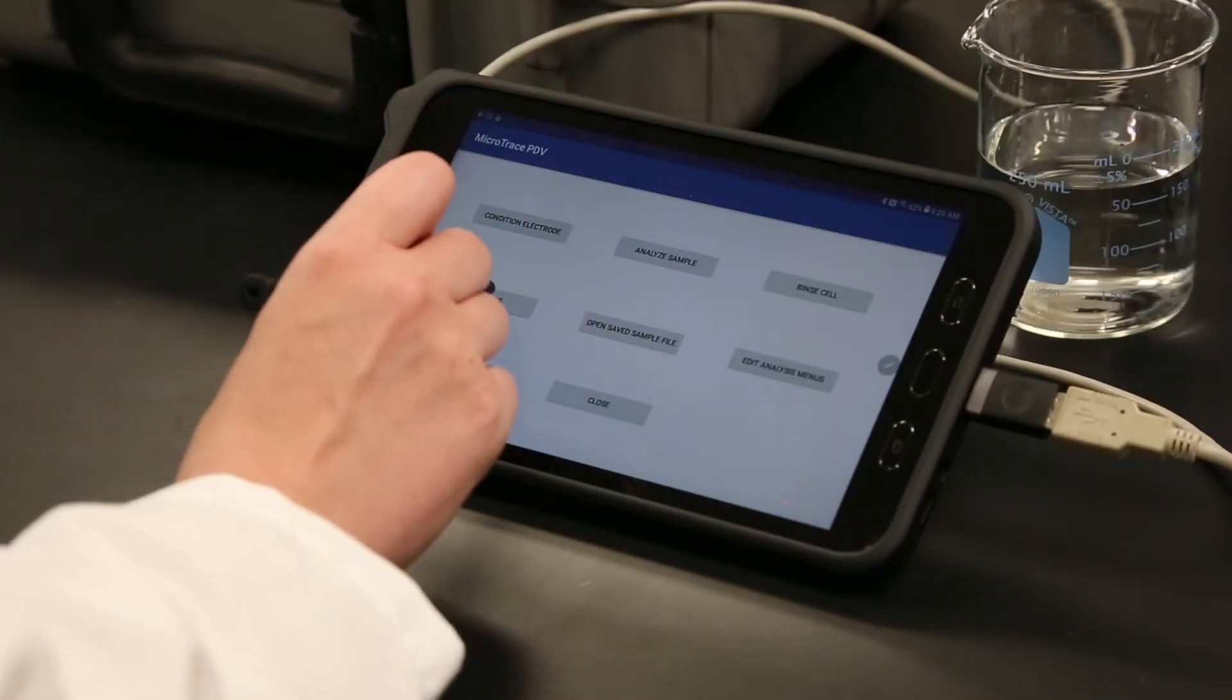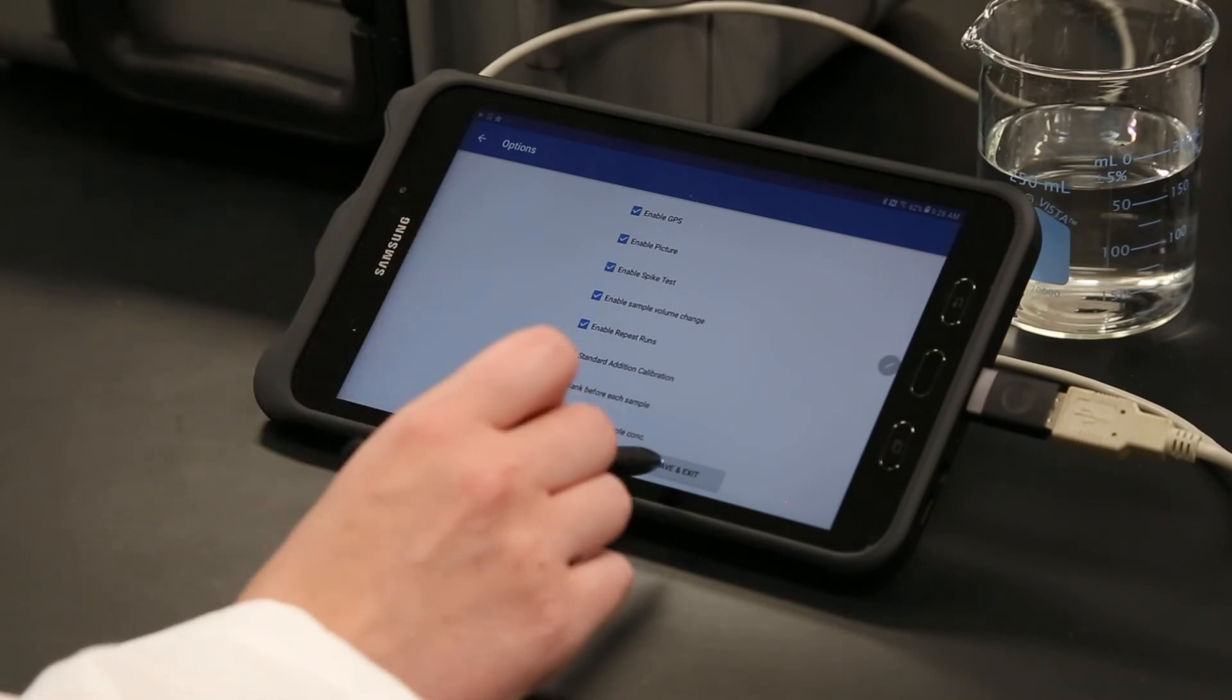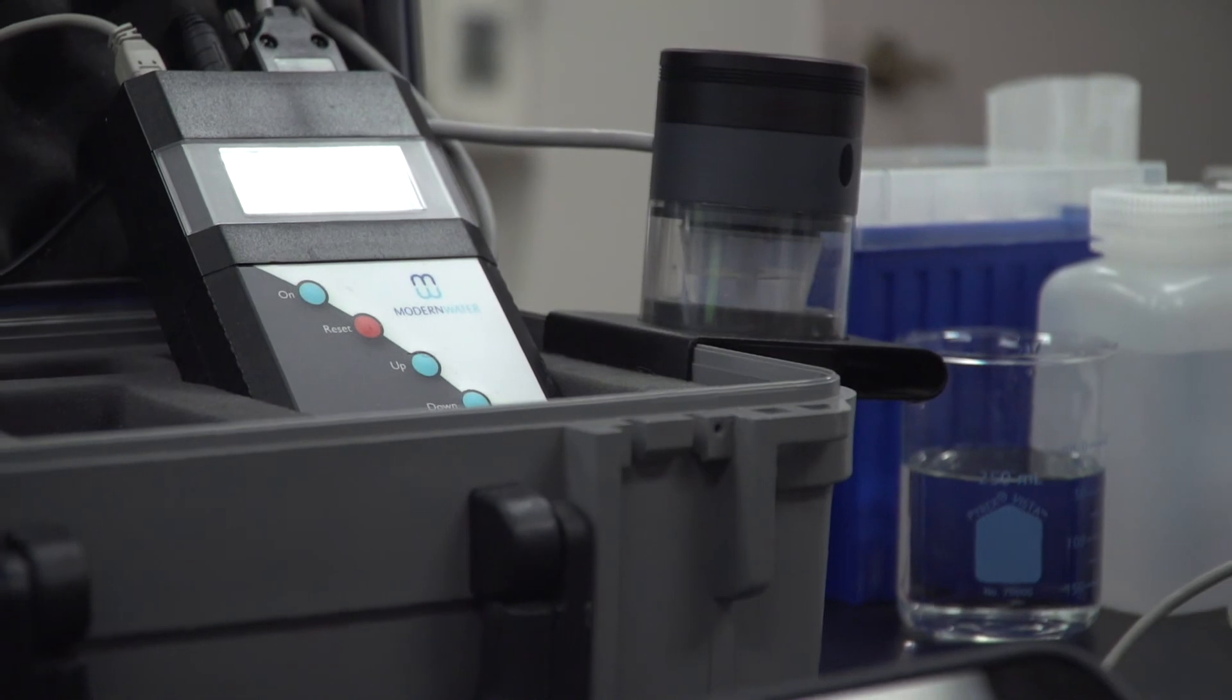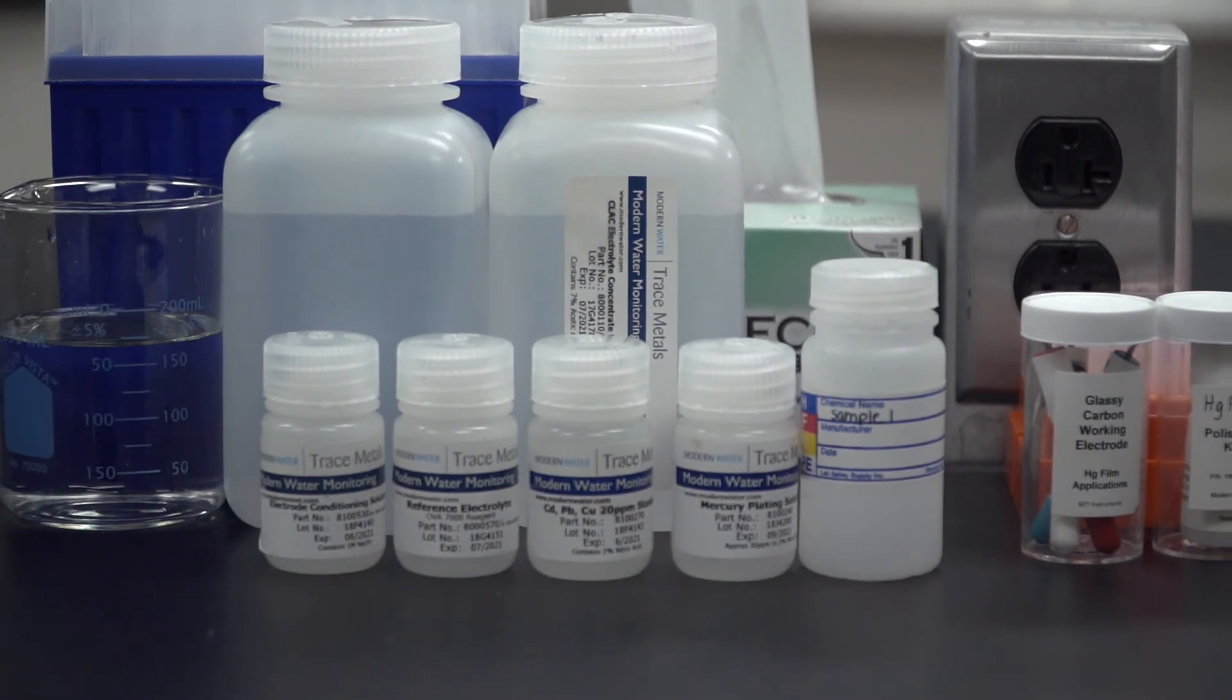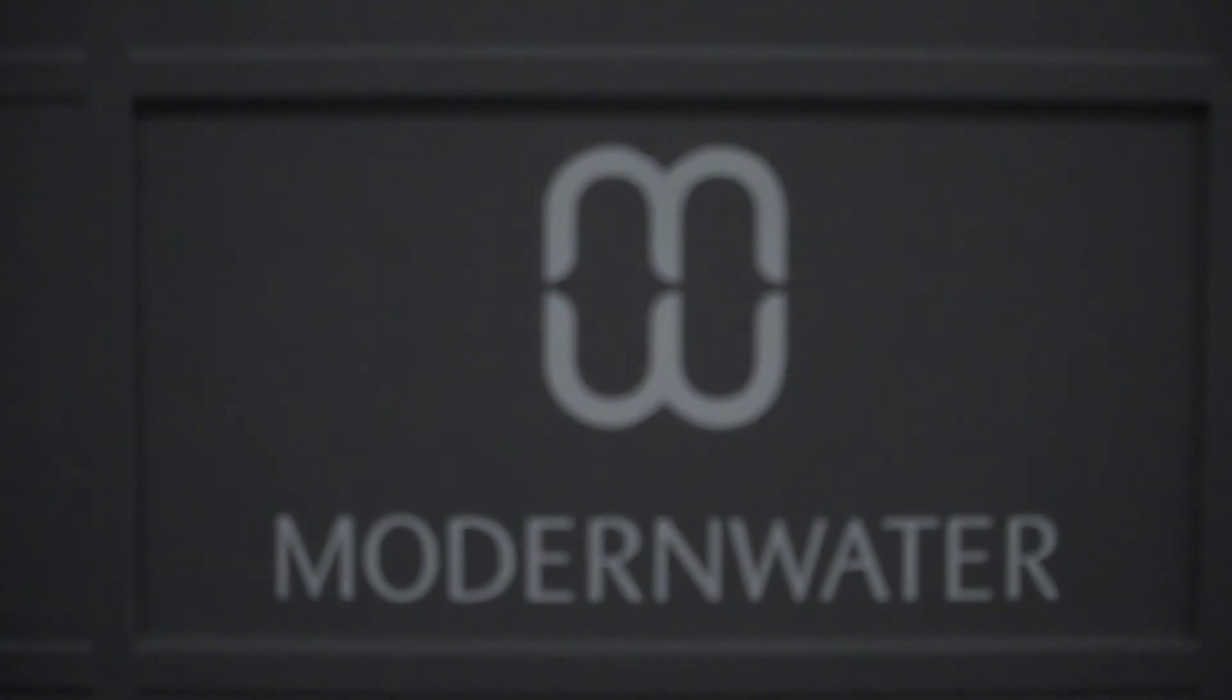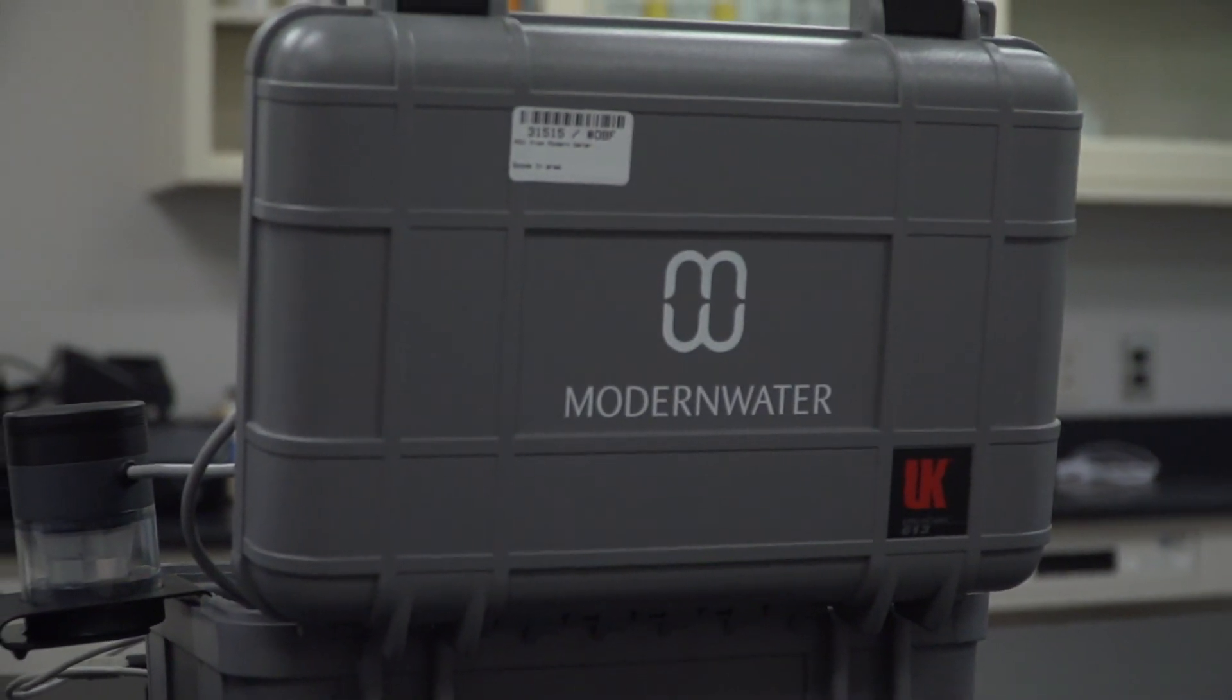Other analysis options such as sample spike testing, standard addition calibration, and other features are explained in the manual. The Microtrace PDV is a portable analytical instrument capable of detecting and analyzing over two dozen metals down to low parts per billion or sub parts per billion levels, providing rapid results allowing for the immediate identification and resolution of on-site problems.